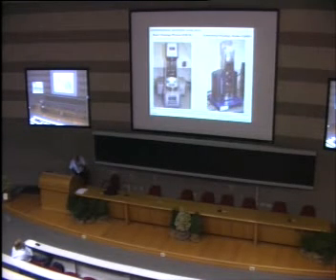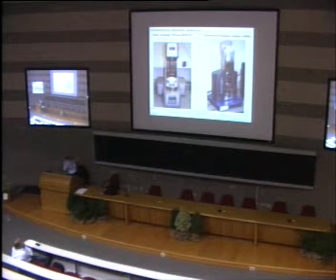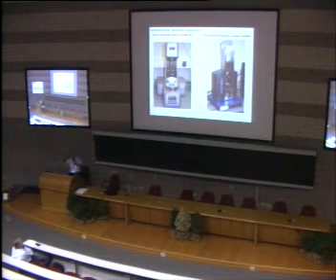Because we are working with non-Newtonian fluids, we have to characterize the rheology of the fluids, and for that we use a rotational rheometer for all kinds of shear measurements. So this is programmable. You can do several kinds of tests. And to assess the extensional behavior and measure also the relaxation time, we use a so-called capillary breakup extensional rheometer.